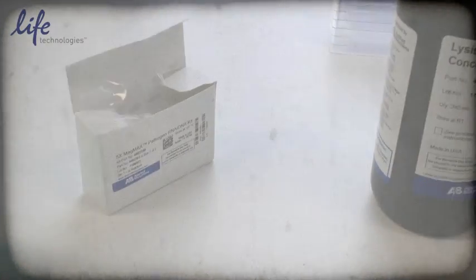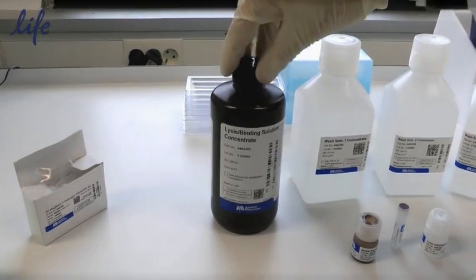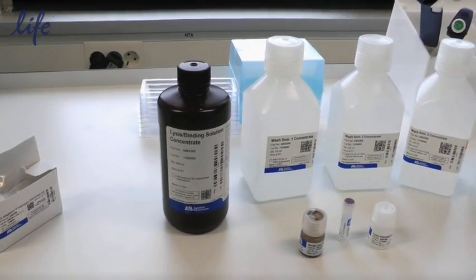So these are the main reagents for our MagMax Pathogen RNA-DNA kit. Here we have the lysis binding solution concentrate, wash solution 1, wash solution 2 concentrate, and elution buffer.